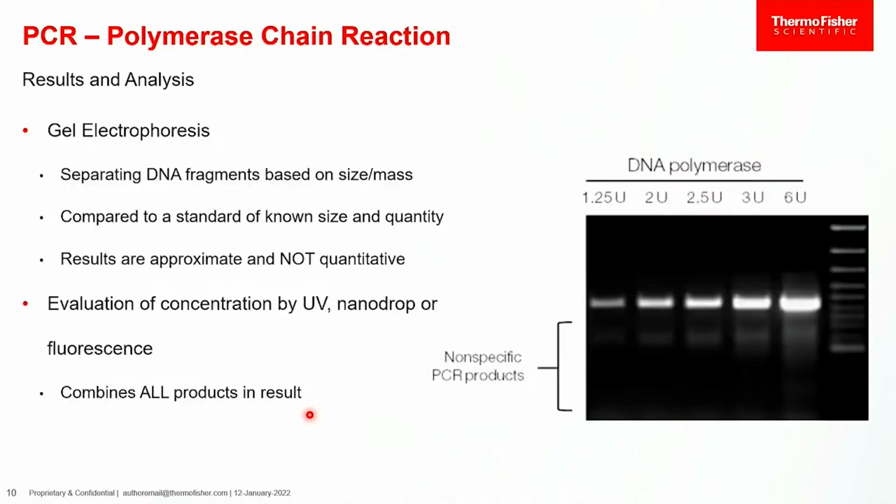You're going down a rabbit hole. So I'm going to touch on the rabbit hole and then bounce back out because I don't want to fall in. If we look at, say, we're all humans, let's talk about the human genome. There are a lot of genes that are represented as homologs. And if we start going back in lineage, this goes all the way back to individual cells. There are a lot of genes that are very similar and do very similar processes. So when you are designing primers, there is a lot of work you have to do to make sure you're actually making what you think you're making.